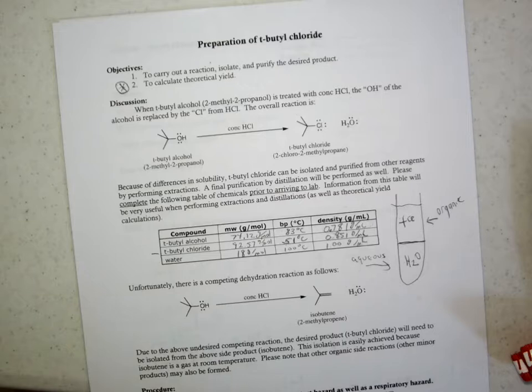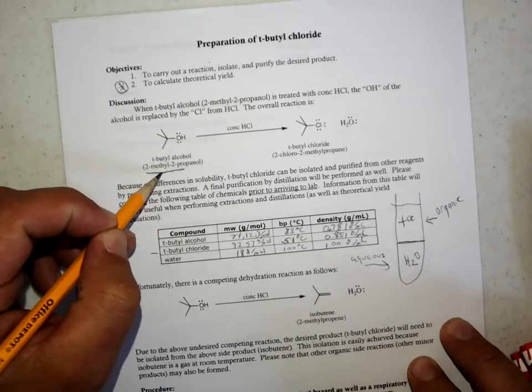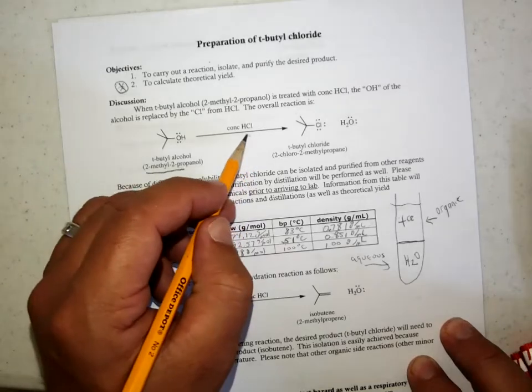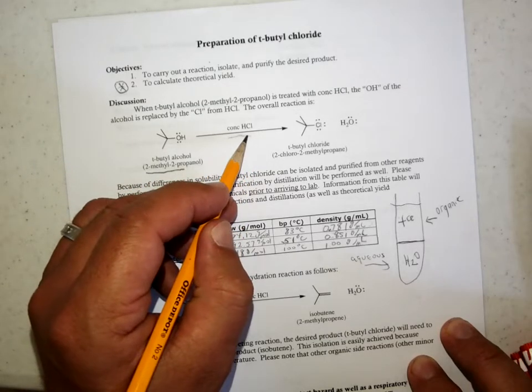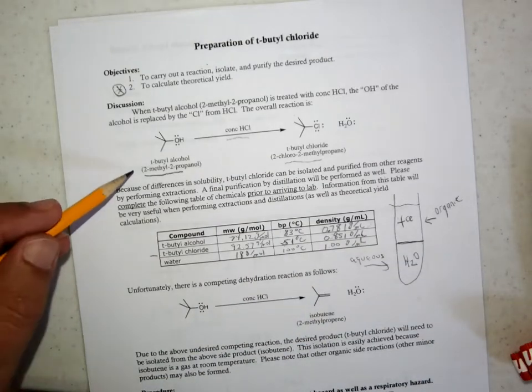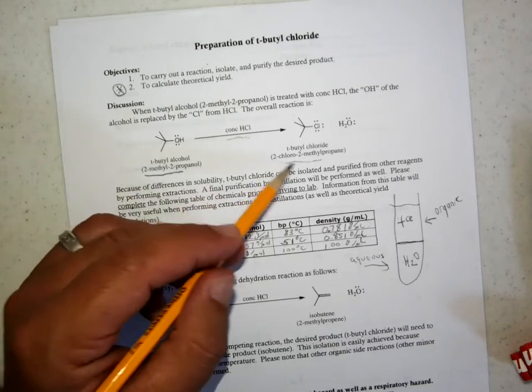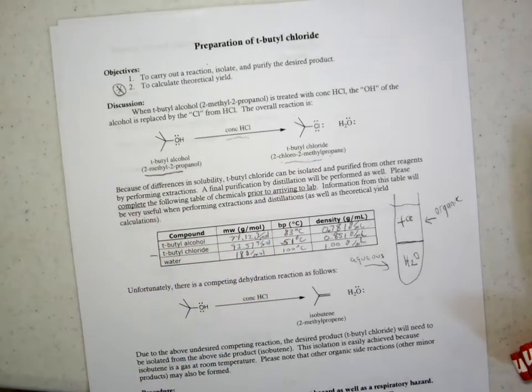The overall reaction is one that I discussed in the lecture video. T-butyl alcohol in the presence of concentrated hydrochloric acid turns into t-butyl chloride. Notice the more systematic naming here: 2-methyl-2-propanol and 2-chloro-2-methylpropane. Good names to know. People switch back and forth between common and systematic nomenclature all the time.